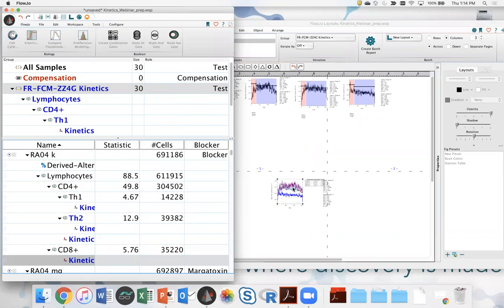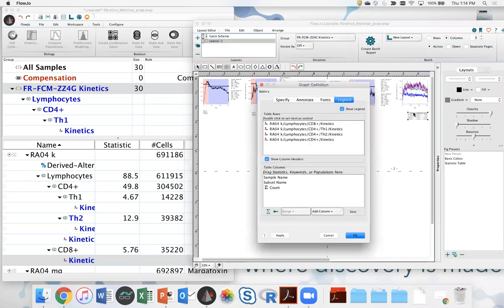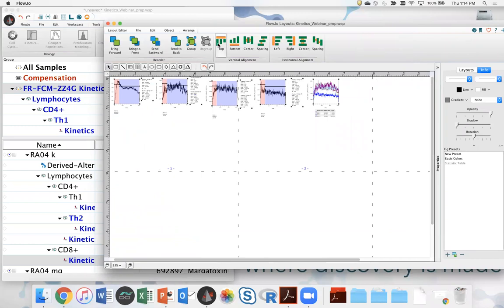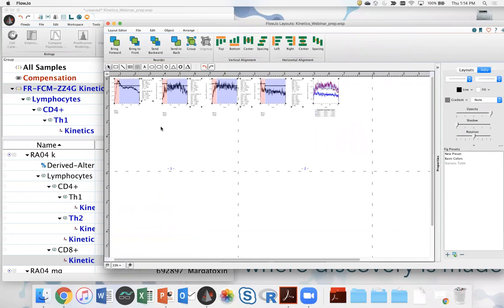And we then can get a direct comparison of the magnitude of all the responses. I'm going to delete that here as I have all the numbers elsewhere. Maybe just set that at the end with its legend underneath. Neatening up, I'm just going to highlight the row with that and arrange it so that their tops line up. Maybe bring that down just a touch.